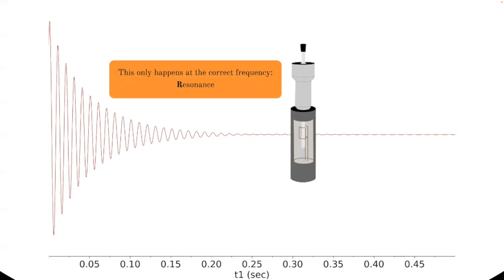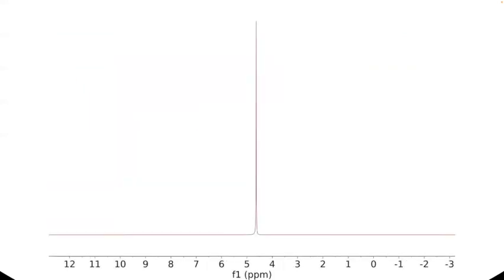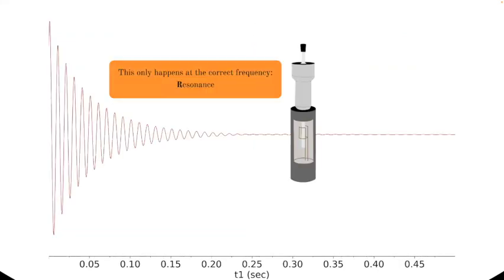We can look at this signal and say, well, we could probably even analyze that in a simple case of just water in a magnetic field. But what we normally do is something called the Fourier transform. This is the same data as shown here. So this is collected over time in this free induction decay.